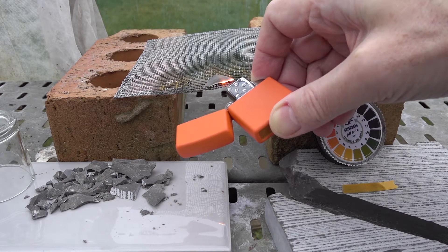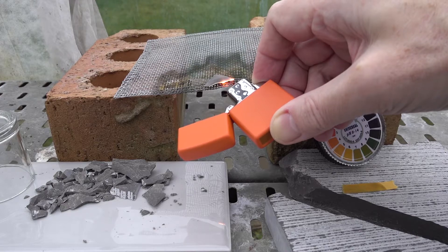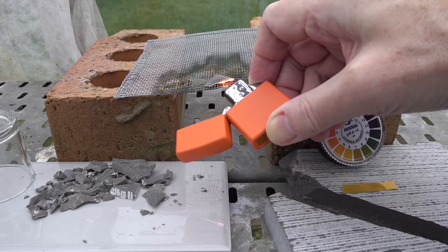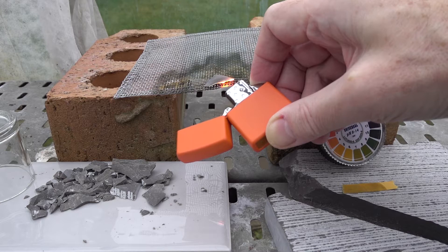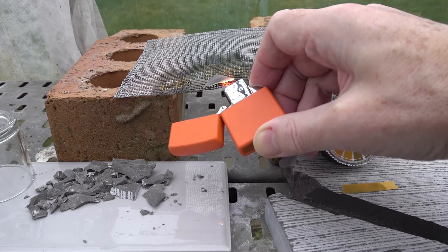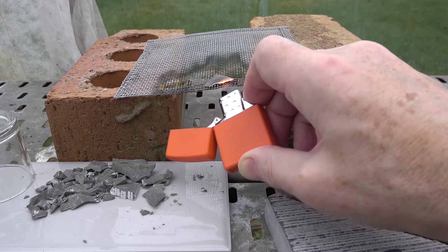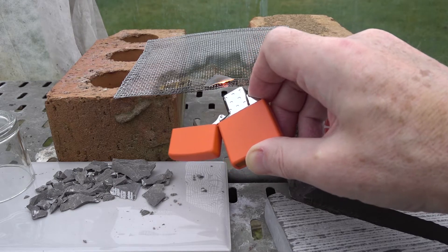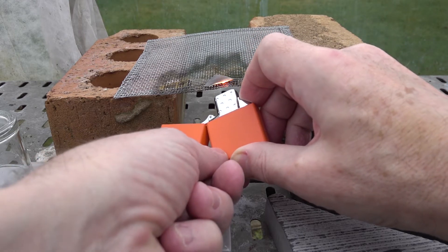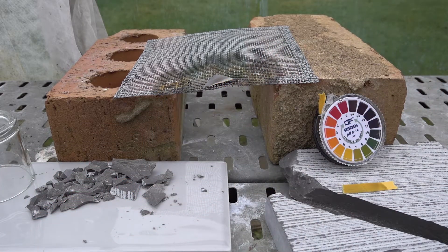Of course, in the lab you'd be doing this with a Bunsen burner, but here we're using a small propane lighter in the greenhouse. Ordinarily we'd heat for a good 15 to 20 minutes with a Bunsen, but here we're only able to heat the edge for a minute or two. It's getting quite hot, so let's stop there.